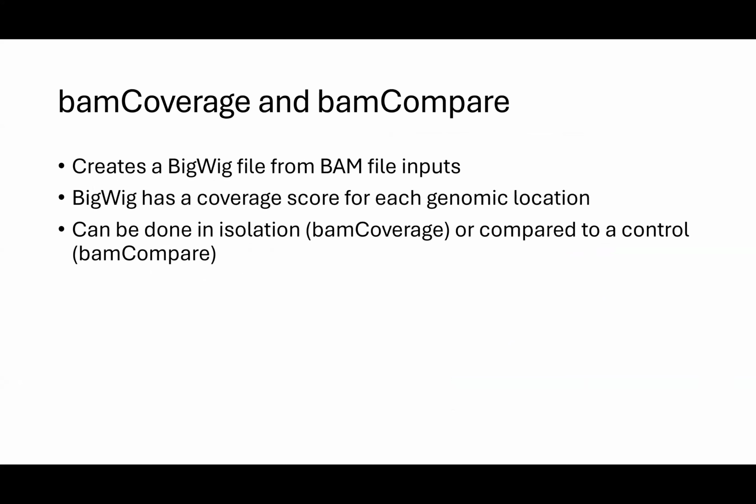So this can be really helpful if you have that IgG control where you have a lot of signal in it, particularly for ChIP-seq, and you got some reads pretty much everywhere for your control, but you just want to see where along the sample my reads for my target are much higher than the control. It'll just divide along each genomic bin to give you your coverage. So this can be really helpful to have an early normalization of each sample.